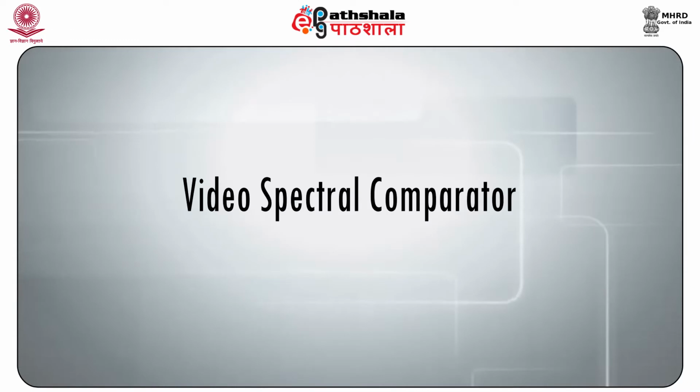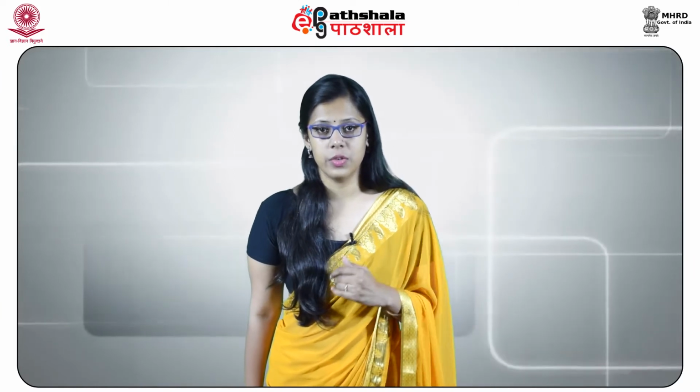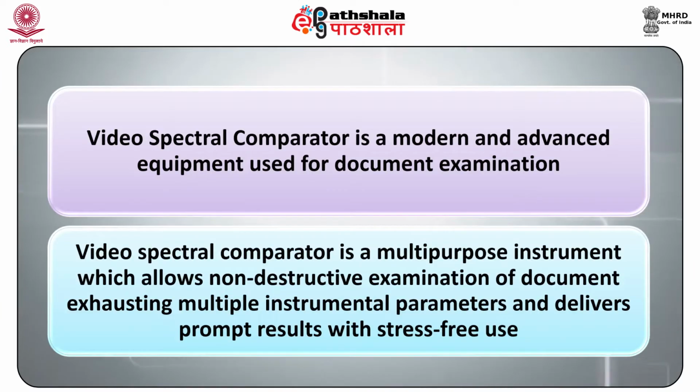Like we have the Questioned Document Division, in which we use the video spectral comparator, which is also commonly called VSC. Comparison and differentiation of ink is done by evaluating the infrared reflection and luminescence qualities inherent to the ink, most frequently accomplished using a device known as the video spectral comparator, which is, as I told, VSC. The video spectral comparator is a modern and advanced equipment used for document examination.